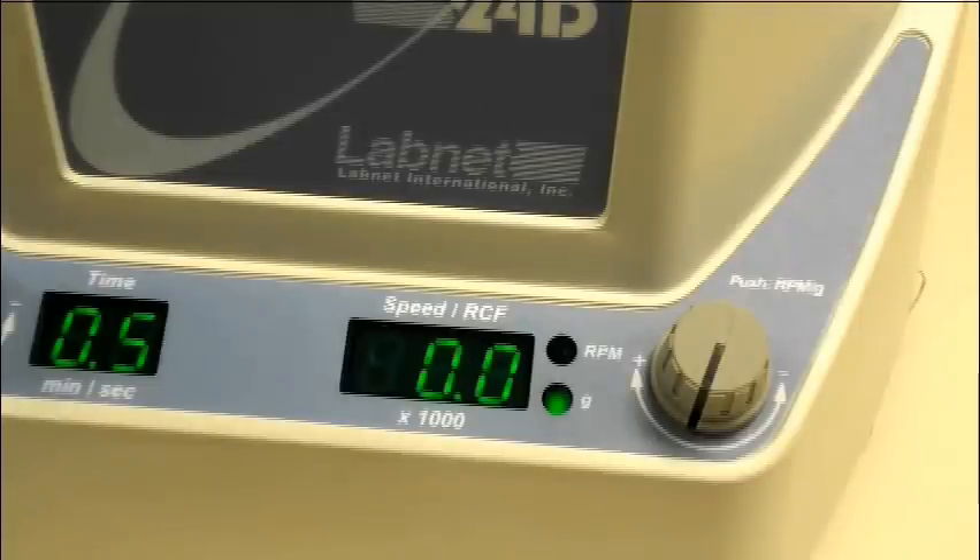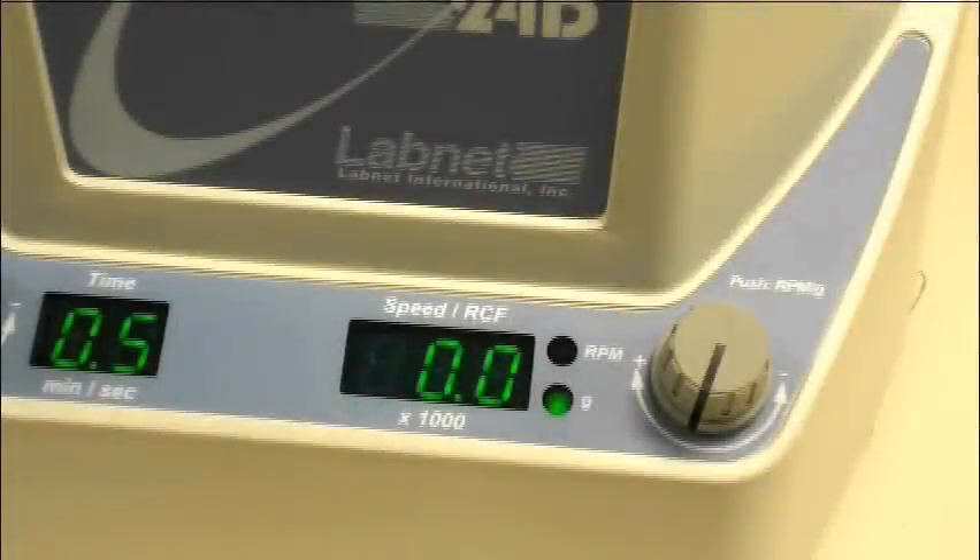Force, on the other hand, can be set in increments of 100, with a minimum RCF value of 100 all the way up to a maximum RCF of 16,300. This is a surprisingly unique feature for a centrifuge of this price range. Being able to control both speed and time is crucial in many separation experiments, and we're scratching our heads wondering why so many manufacturers offer so little for so much.